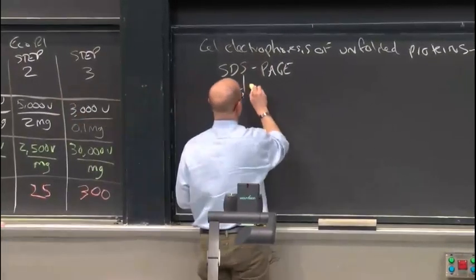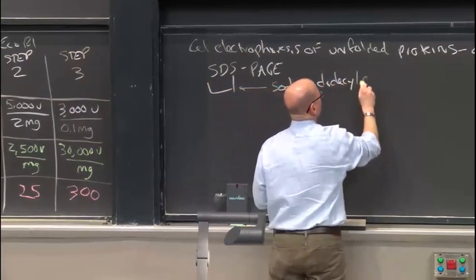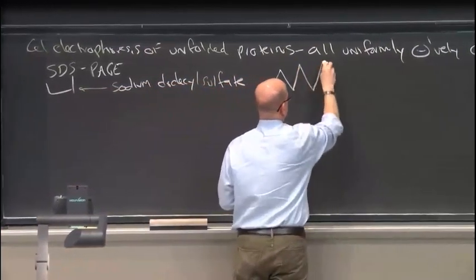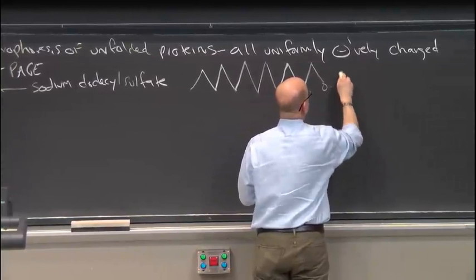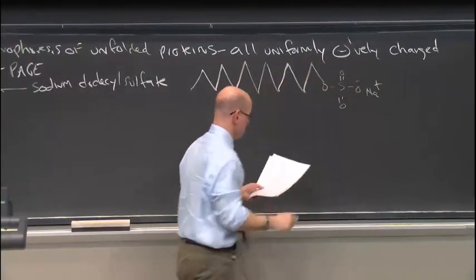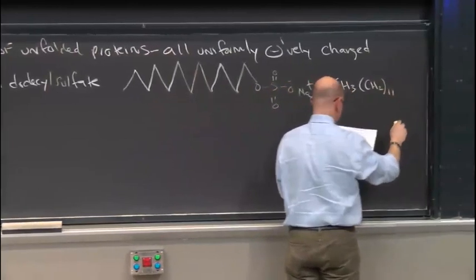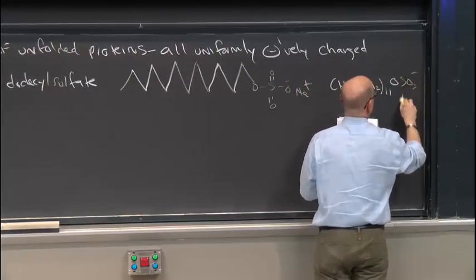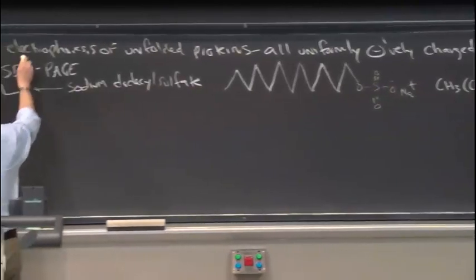SDS stands for sodium dodecyl sulfate. A molecule that looks like this. 1, 2, 3, 4, 5, 6, 7, 8, 12, O. S, double bond O, double bond O, O minus. The formula is CH3, CH2-11, OSO3 minus Na plus. Okay? Sodium dodecyl sulfate. That's this SDS page term.